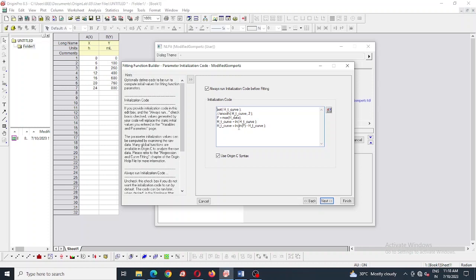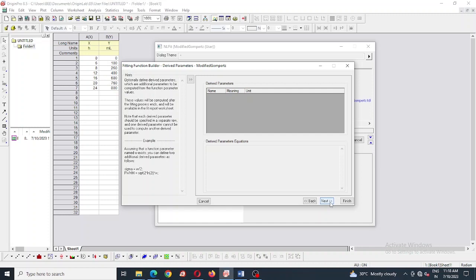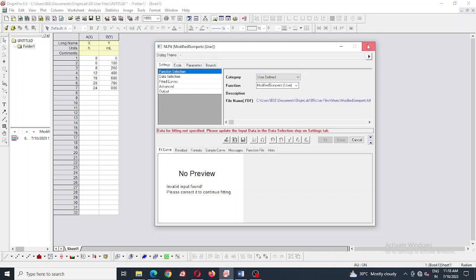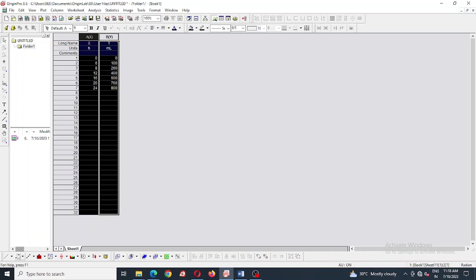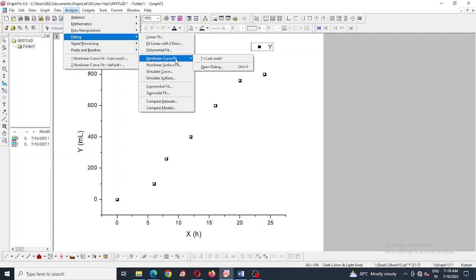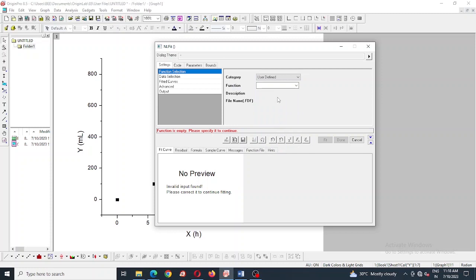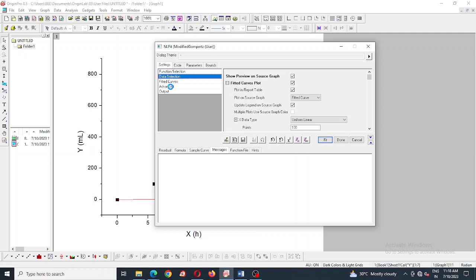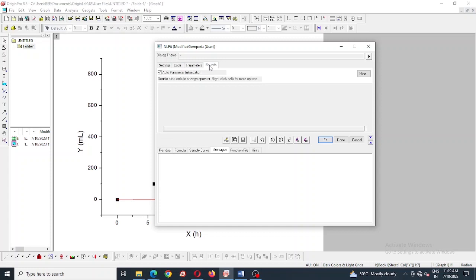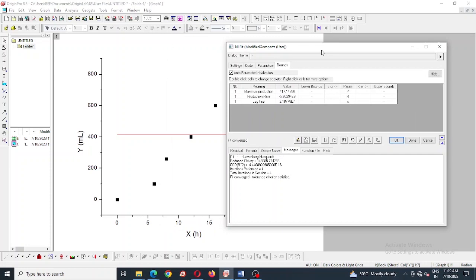Now we are going to add modified Gompertz equation fitting into this results. So select those results by pressing control and that tab, next scatter plot, next fitting same as nonlinear curve fit, next open dialog, then user defined function and modified Gompertz equation. Further we can check any parameters, equations, etc. It's looking okay then I'm going to fit it.